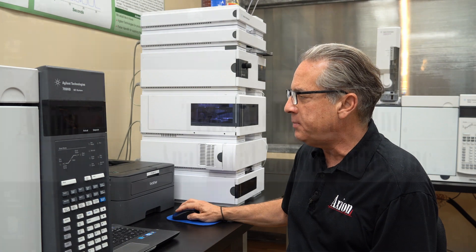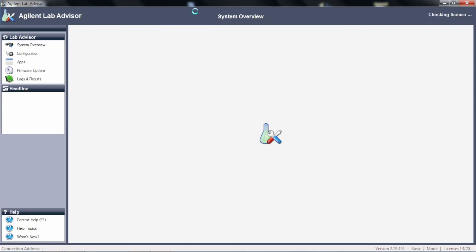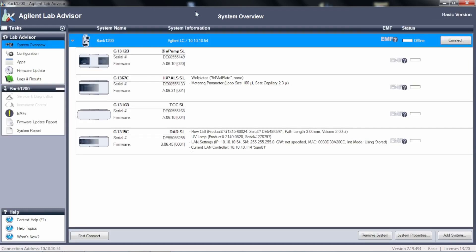So I'm going to open up the Agilent Lab Advisor. And again, this is a free download, and it can control and run diagnostic tests on any of the Agilent LC systems, the 1100s, 1200s, 1260s, infinities, and so forth.